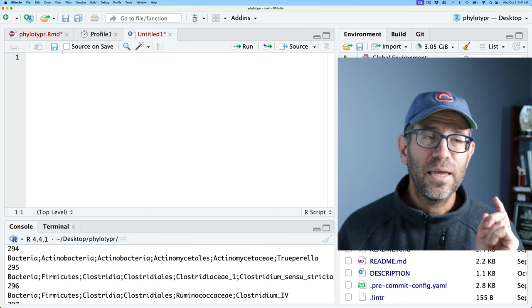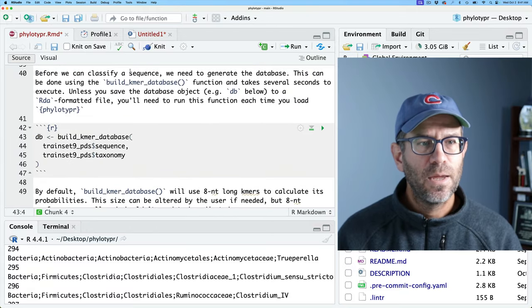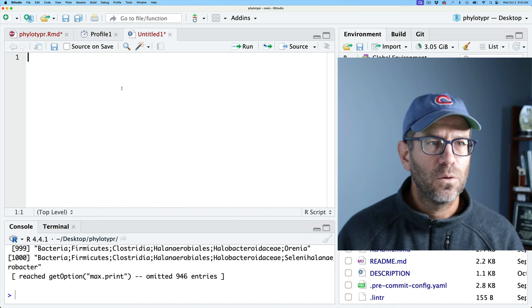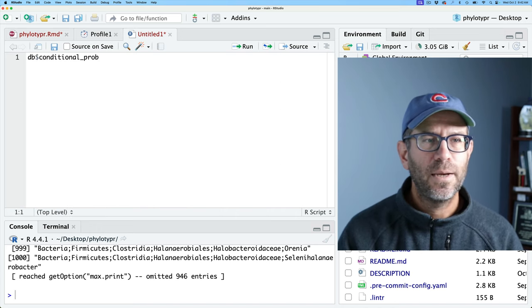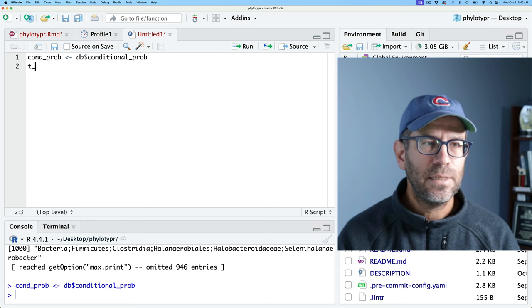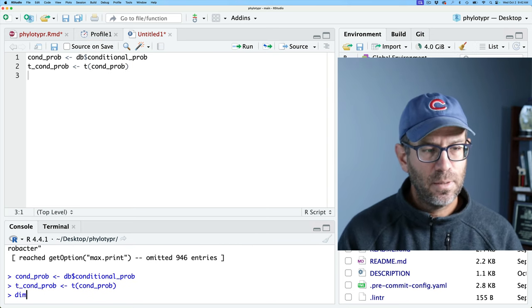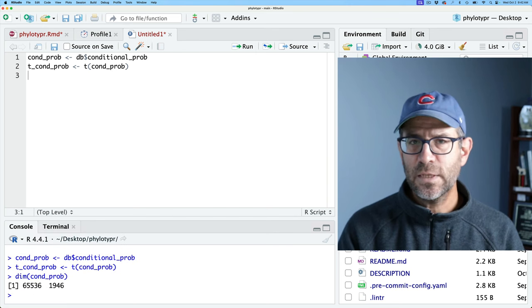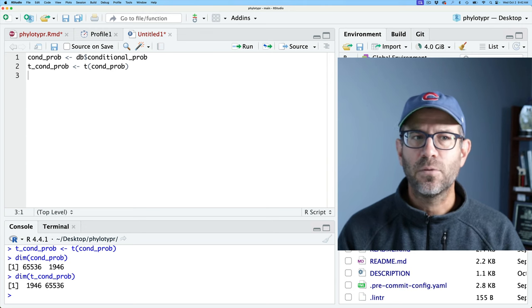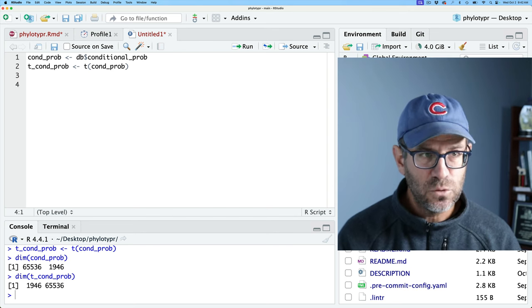Let's test that out. The matrix we can use is the conditional probabilities in our database. So if we look at db, we have conditional_prob as well as the classifications. I'll do cond_prob equals db$conditional_prob, and t_cond_prob which will be the transpose. If we look at dim on cond_prob, we see it's 65,536 rows and 1,946 columns. And dim on t_cond_prob will be the opposite. Now we want to write a function to get the row sums versus the column sums. I'll do c_sum function using Rfast's colSums, since that's what we're already using, and r_sum using rowSums on t_cond_prob.